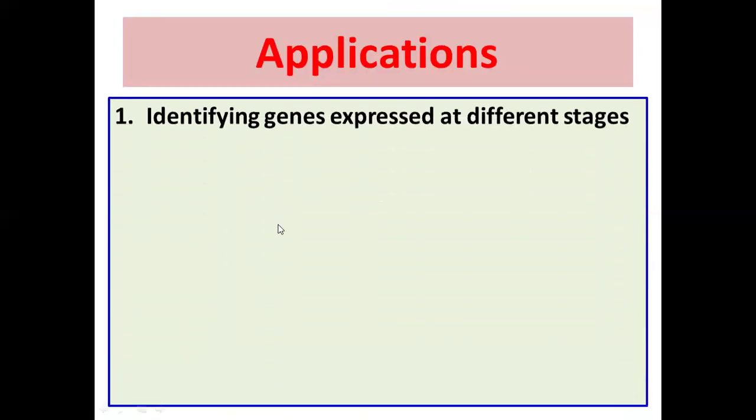What are the applications of subtractive hybridization? Identifying genes expressed at different stages. As I told you, if you take seed germination as an example, from radicle to complete germination, or zygote to fetus, right?